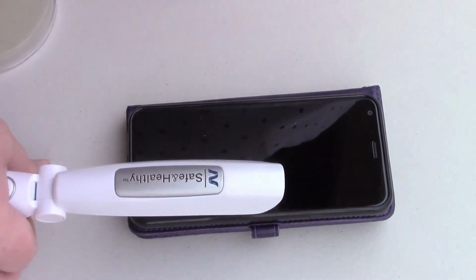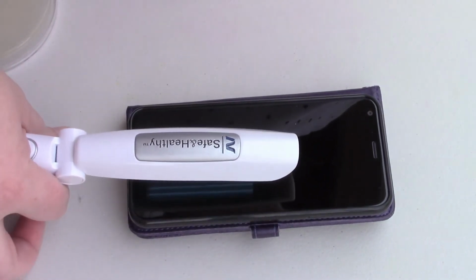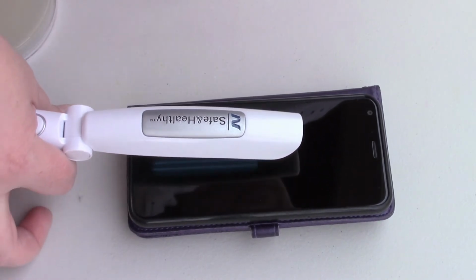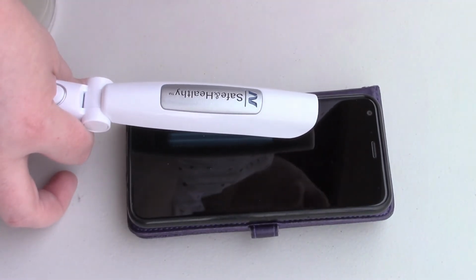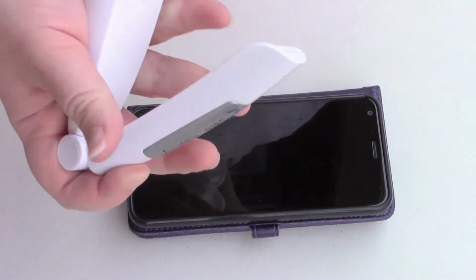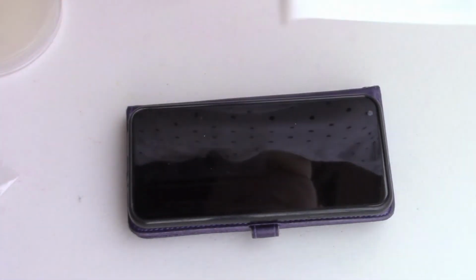So I have sped up this portion, but just be aware that it may not be ideal to do large items, though it does have the benefit of, alcohol and detergent may destroy some things and may not be as useful for cloth or wood, right? And you can use the UV on that. So not a bad idea to get either. Getting a brand new swab. Again, you can really see the difference there with the dust and the greasiness.